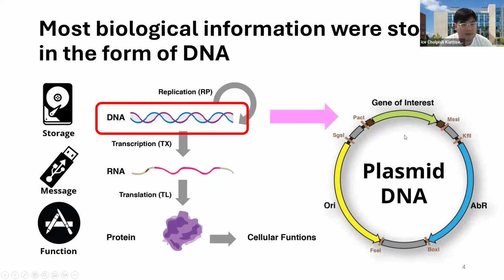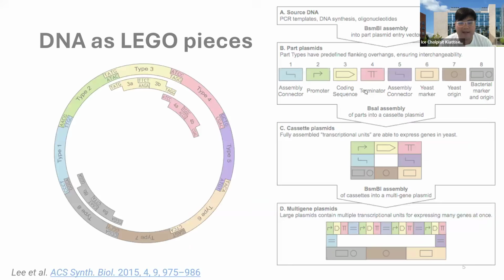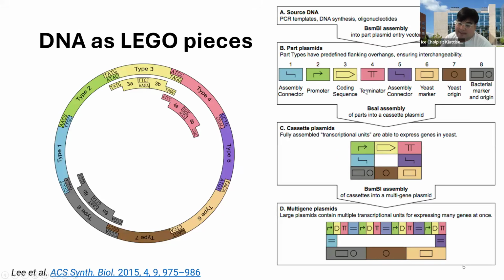So, that would be a good place to take a look at if you wonder what a plasmid is, or what kind of plasmid you should be using in your processes. But with that, if you have a plasmid, we can consider DNA as a Lego piece as well.